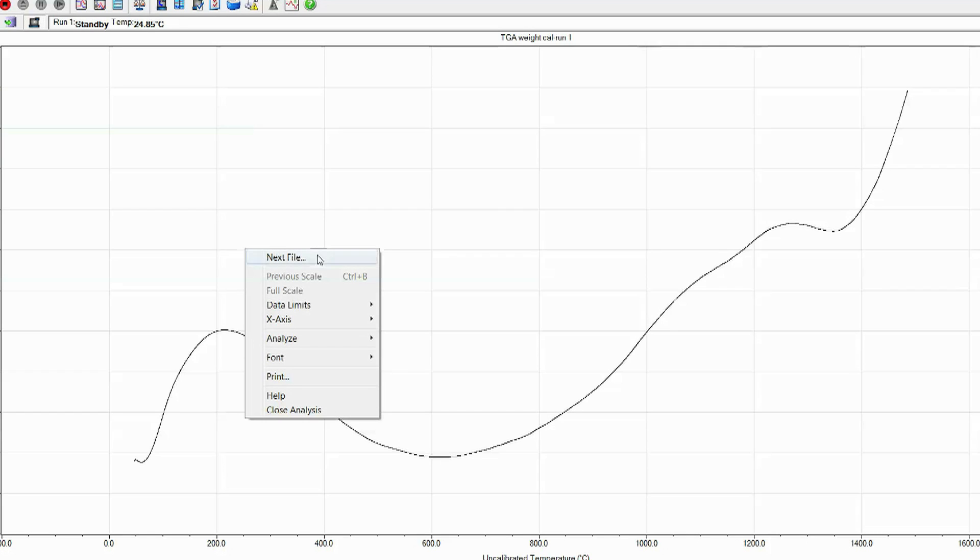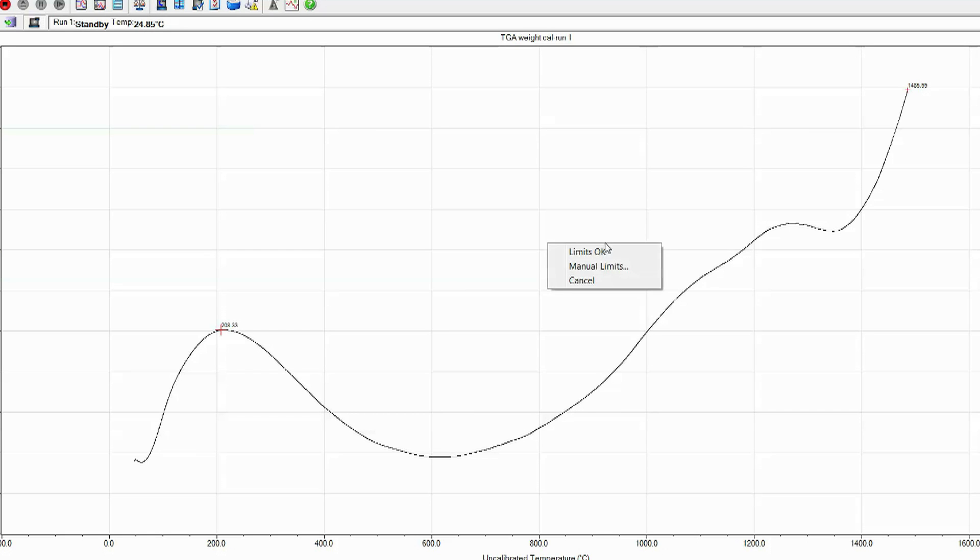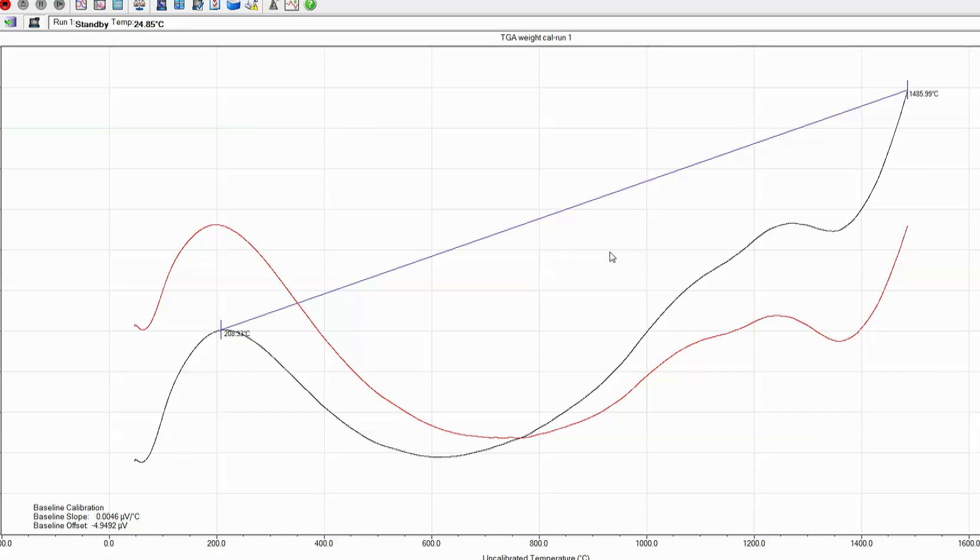Right click on the screen and select analyze and select the temperature limits as described before. Once the temperature limits have been selected, right click on the screen and select limits. Okay.